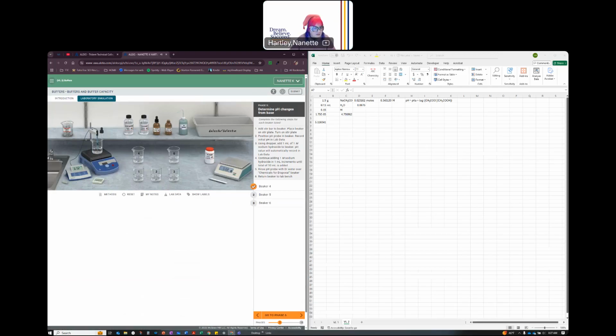Do it again. 2, 3, 6, 7, 8, 9, 10, 11, and 12. Oops. Oh yeah, too much. Oops. Only 10, not 12.